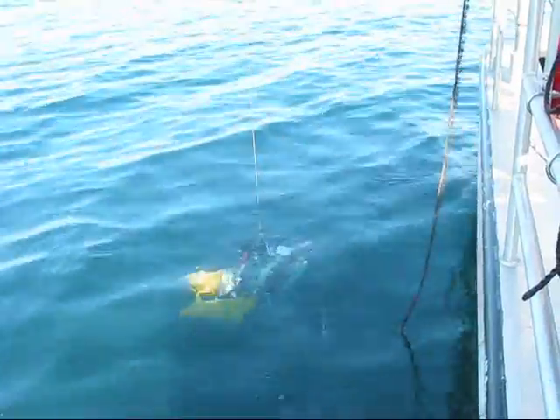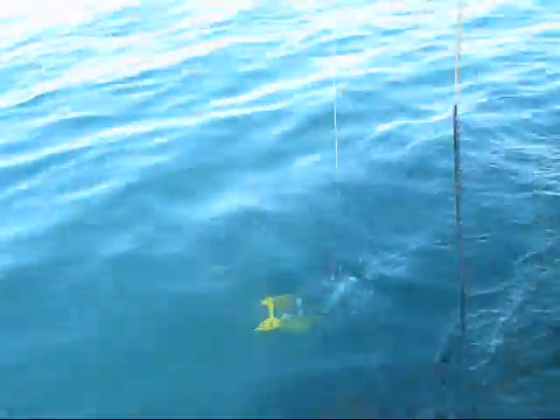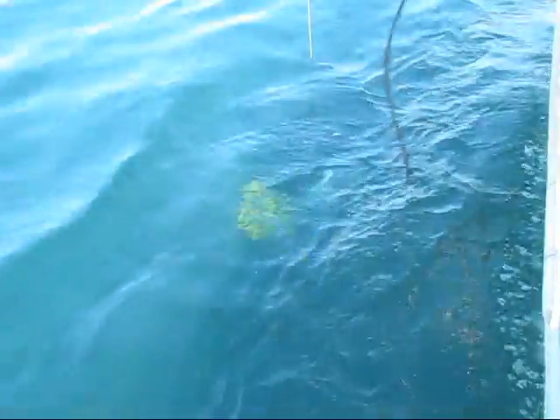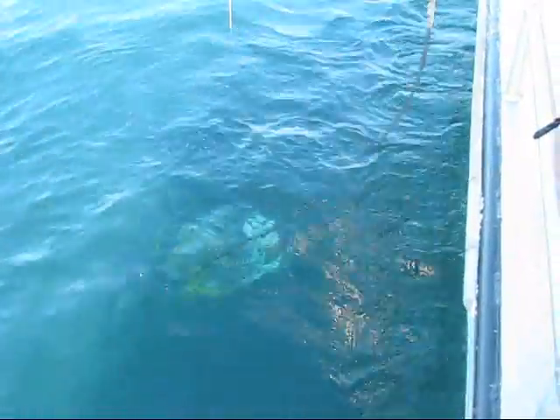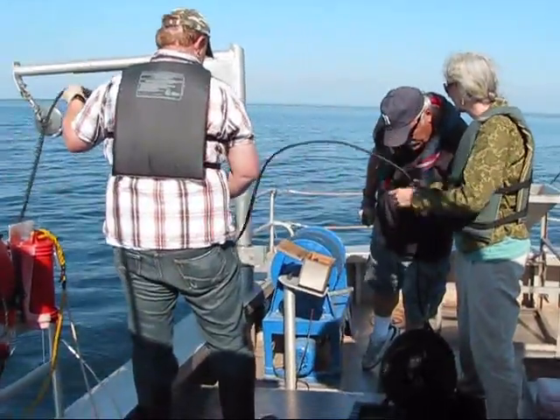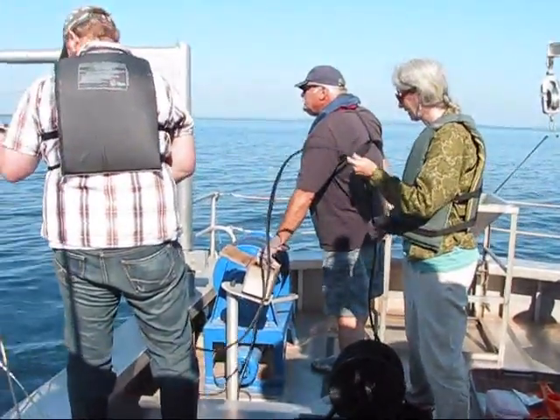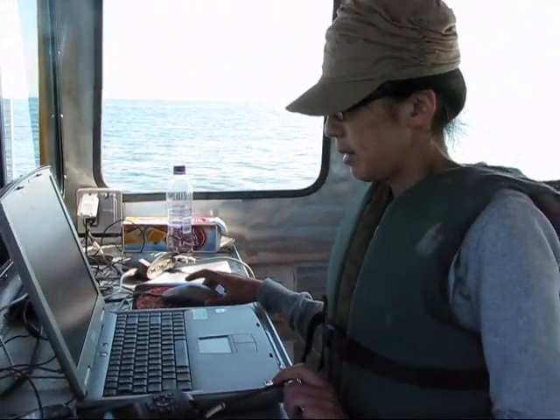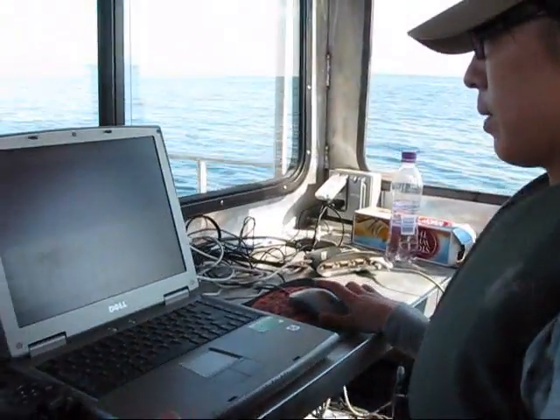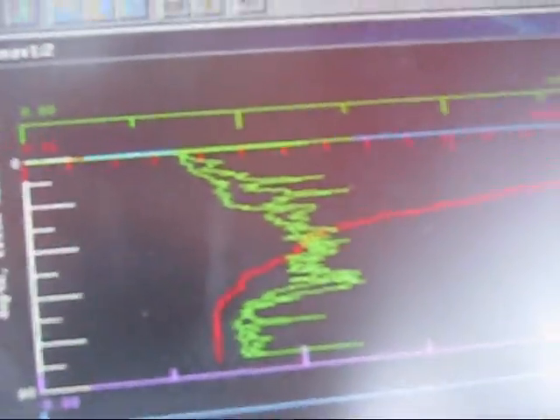Start slow and then we'll speed up. Go to meter. How does it look, Julie? Good? Okay. So what's the green? Chlorophyll. And the red? Temperature.